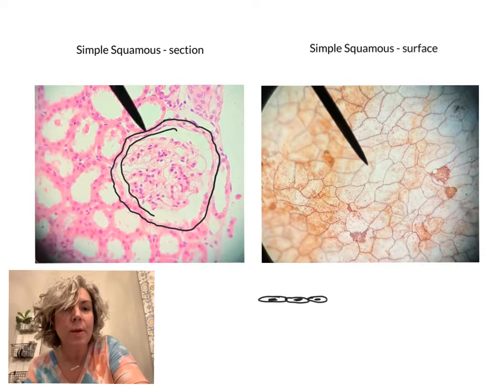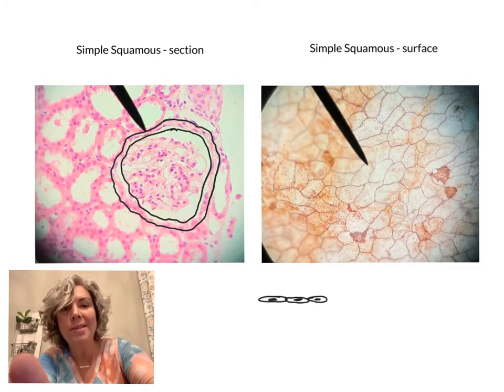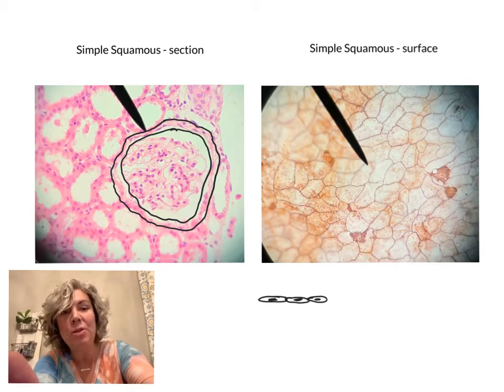I'm going to try my best to circle it around. Right in there. Now, in between, where I've attempted to draw that circle, that's going to be your epithelial tissue. So let me draw an arrow pointing at this squished nucleus, and maybe you'll see what I'm talking about. I'm going to put an arrow right here. You see that squished nucleus right there?